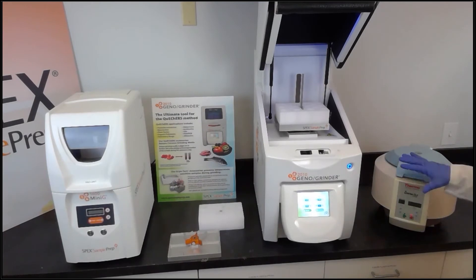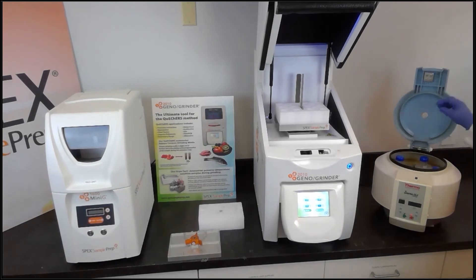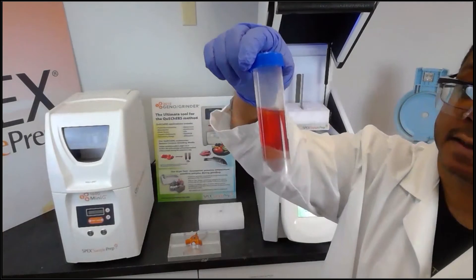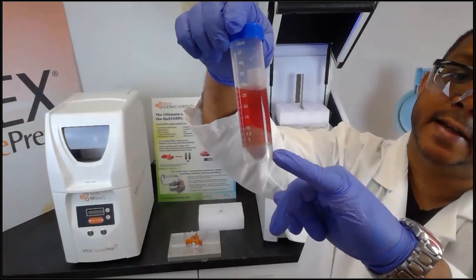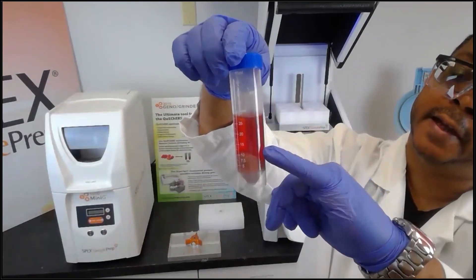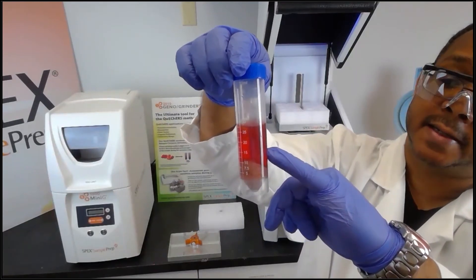After the centrifuge has completed its process, you open the lid. I have prepared samples to show what the results look like after centrifugation. You can clearly see that the solid layer has been separated from the liquid layer — the liquid layer is the organic layer that will contain the pesticides.